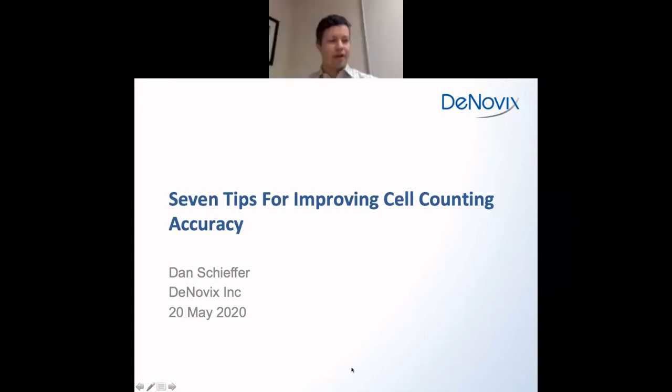So first, thank you for joining us this afternoon. The goal for this presentation is to give everybody a better understanding of cell counting. I know for myself, in particular, that working in the lab and doing routine cell counts, it was a part of the process that I would sort of skip over, try to rush through, get it done quickly.